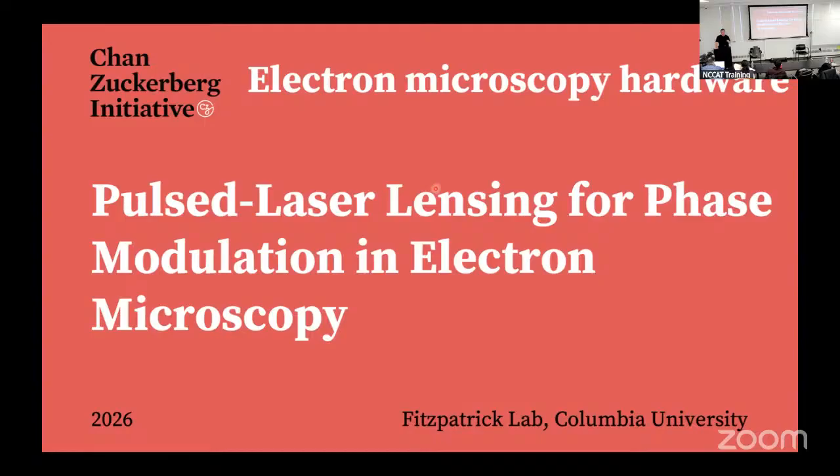And it really just relies upon magnetic lenses. So you have a series of lenses as you go down the column that help collimate and expand the beam to form an image on the detector. And that has been tremendously powerful. I'm sure you all know, or you've seen, or you will see again tomorrow with Ollie Clark and building models, that in terms of resolution, single particle cryo-EM now can be as good as 1 angstrom resolution. So you can really get to true atomic resolution.